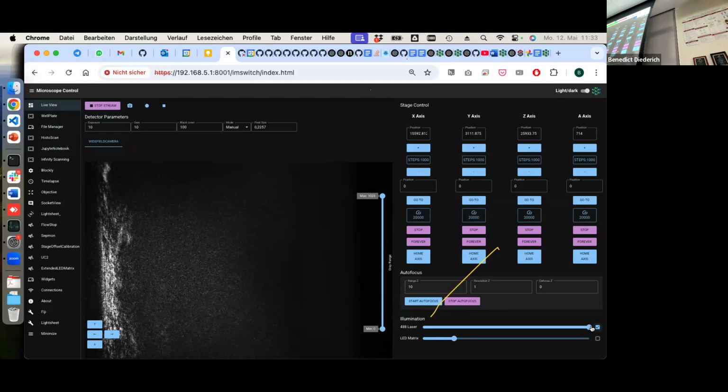So there's a plain wave coming out of this laser, but then there's another lens that is making this wave go kind of divergent, so that we have a bigger spot in the end. That means the beam here is divergent, so the wave in the end is not parallel, but rather it's a sphere. So it's going on spheres or parabolas or something. It's like alternating between waves.